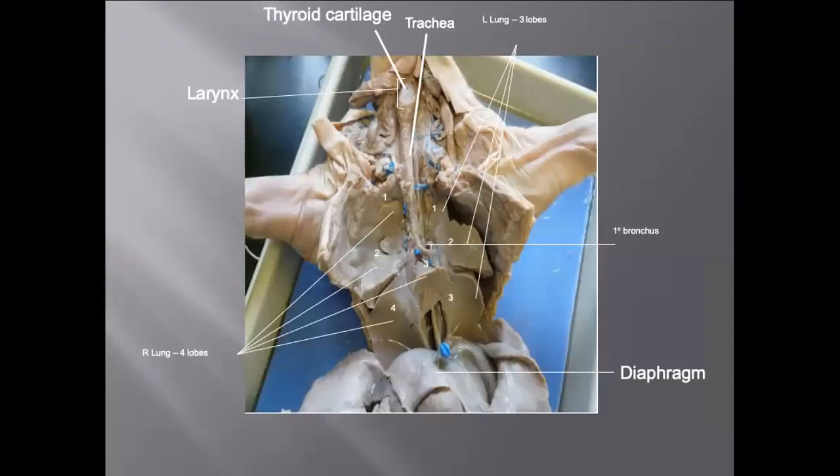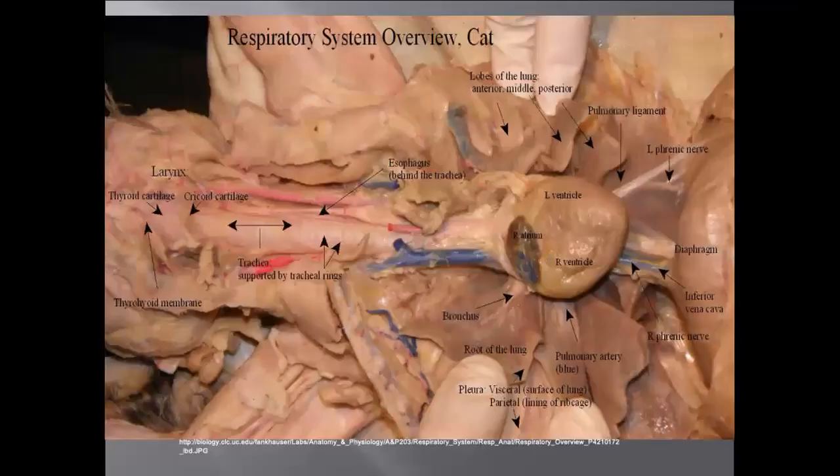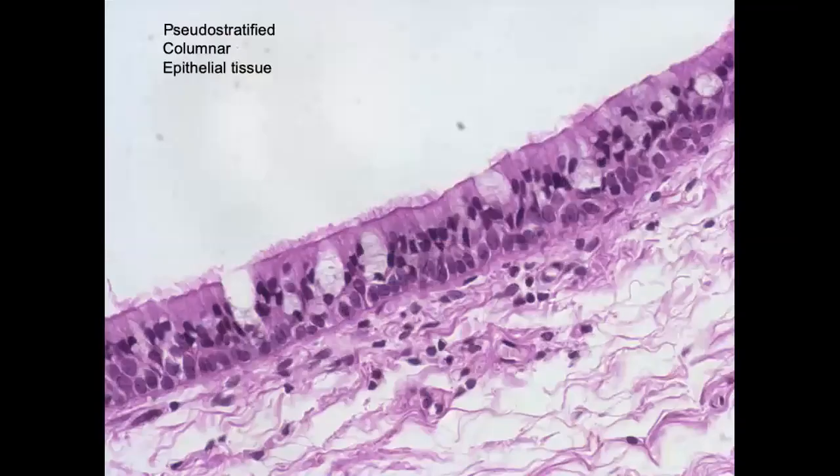All right, this is not going to make as much sense. I won't ask a question like this. On the pig, there's more lobes than we have, so you won't be asked that way. Like I said, we're not going to be pigologists. So know the normal human anatomy as far as the lobes of the lungs go. All right, this goes a little too deep too, so I'm not going to question too much from there.